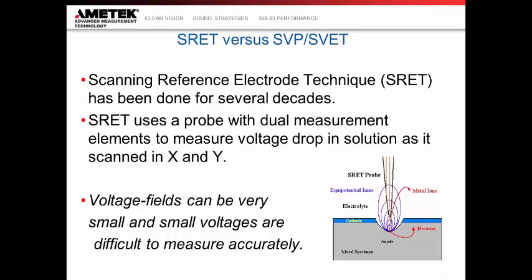But if we think about the sampling volume, or the zone that I'm measuring in, if I have my wires very far apart, my spatial resolution is not going to be very good. And so that means if I have two pits very, very close to each other, I can easily image those as a single event. So the goal of research for many years was to continuously take those two wires and make them closer and closer together, and still try to extract the signal from them.